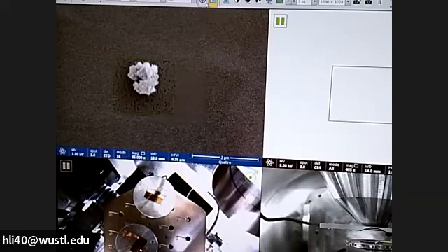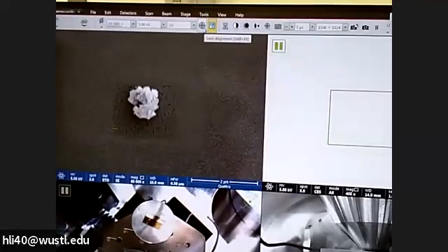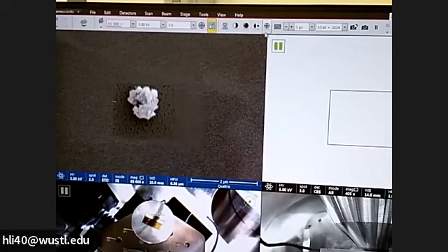All right, so the next thing is lens alignment, okay? We have automatic lens alignment or manual lens alignment here. Normally, again, I only suggest users use automatic when you have a uniform sample. Normally, manual will do better. And I noticed this microscope is very stable. So once you adjust it, it should be good for a long time. So the user normally doesn't need to worry too much.